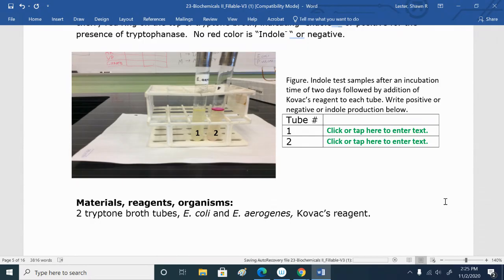It's like, but they just inoculated it with bacteria, right? So you see the problem. You always have to incubate, give the bacteria time to grow and to make the end product. In the next class, you add whatever chemicals you need to see that reaction.